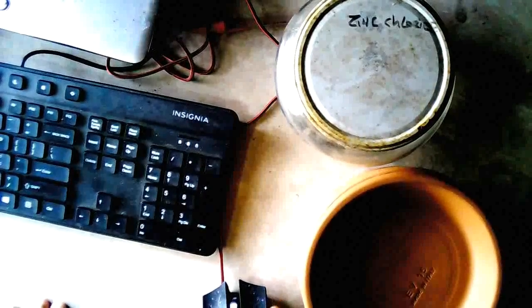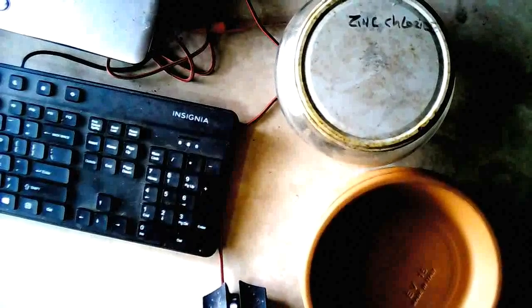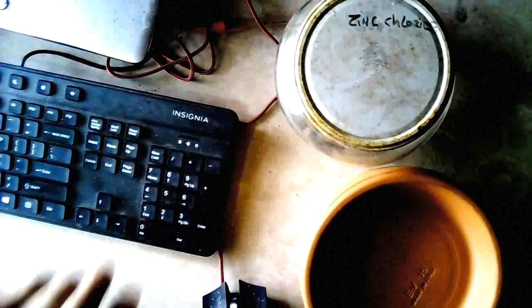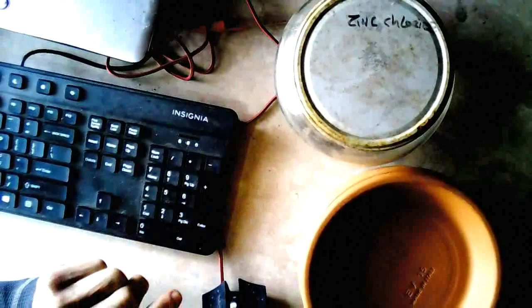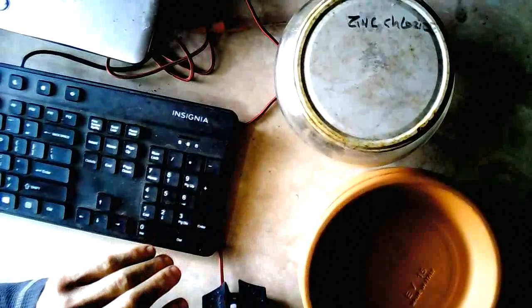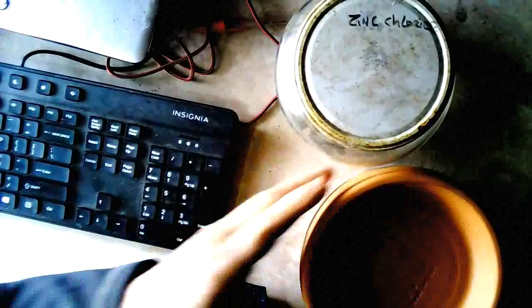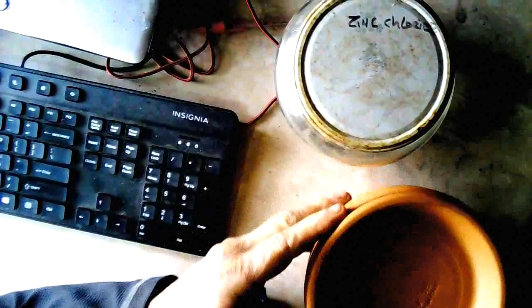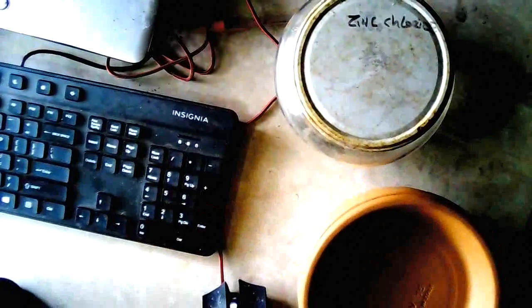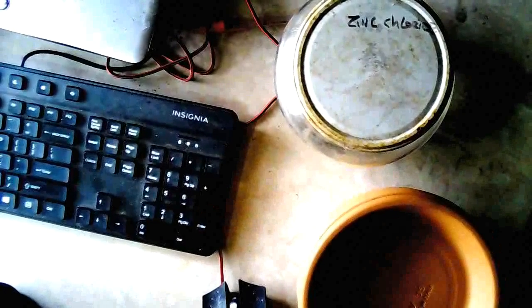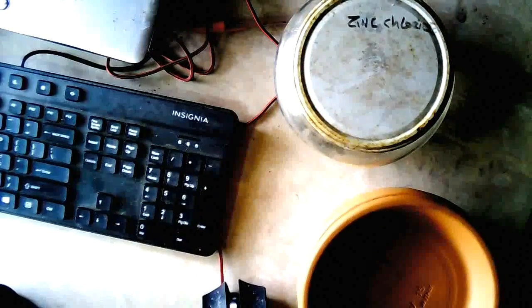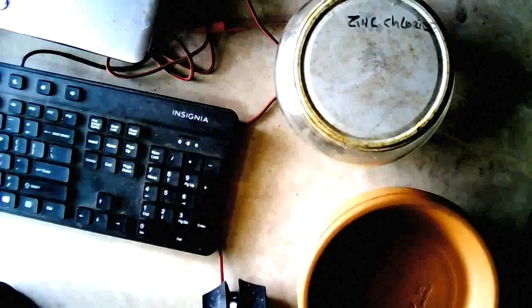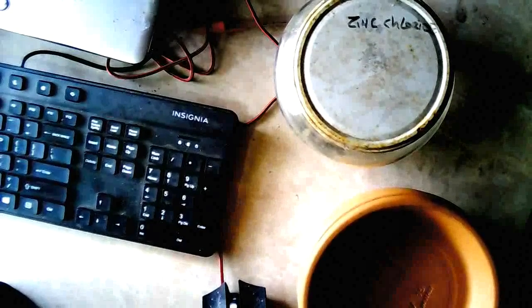Good morning folks. This video is about making zinc chloride and then using the zinc chloride to build a microwave kiln. This is based on a video by Robert Murray Smith and it's simple.